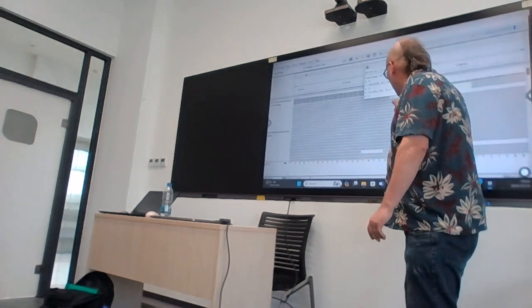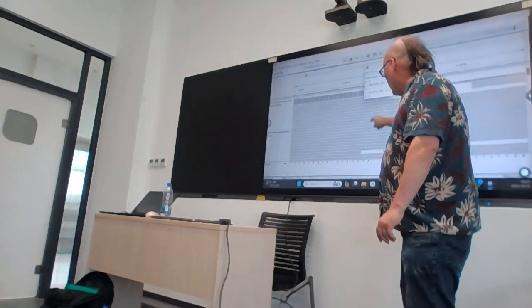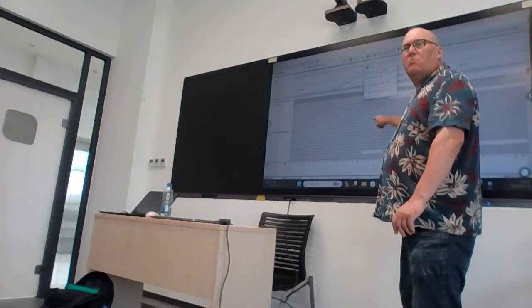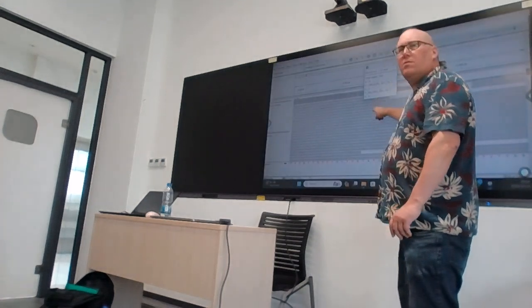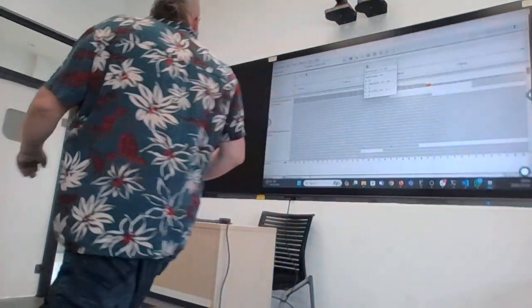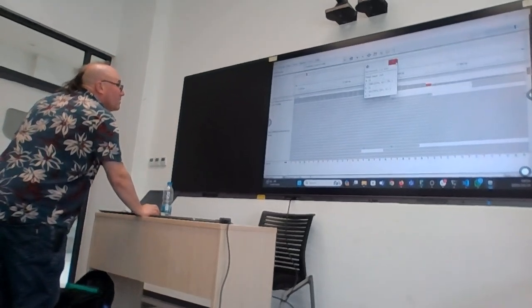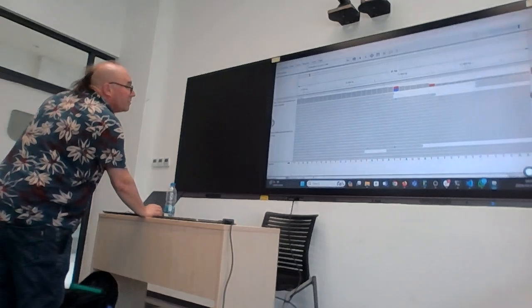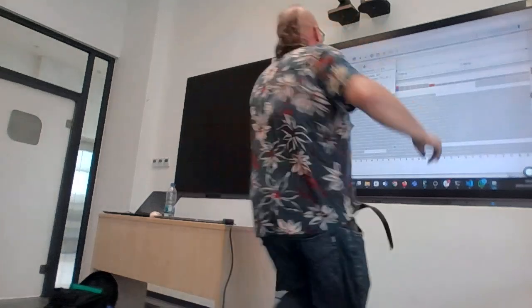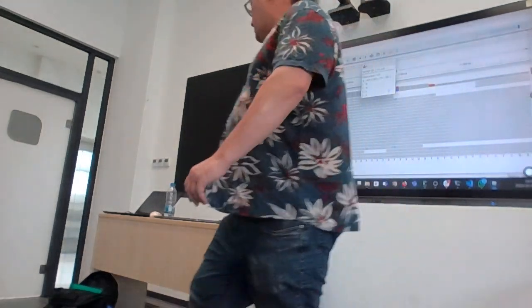Okay? So here, if I look at this position here, what is the letter in the reads at this position? What letter is expected to be here? Here, at this position. A. Okay? And if I went to the top of the screen, above the A, then it says here, A, 165, 100% A. Okay? All of the reads are showing that.